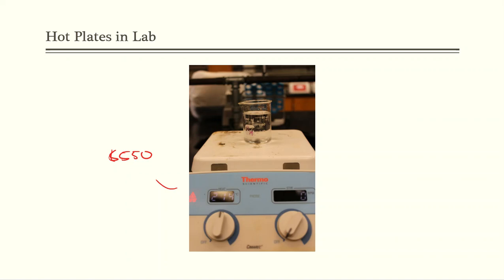Over here to the left-hand side, this is my heating. So this is me cranking up the ceramic top of the hot plate that's up here, and this begins the heating process right from the very start. The knob to the right-hand side, though, is a stir knob. Sometimes when we use these hot plates, they have built-in stirs as well. I can put a magnet on the inside of this beaker that has the solution, turn this knob up, and then this magnet will begin to spin around and around and around.